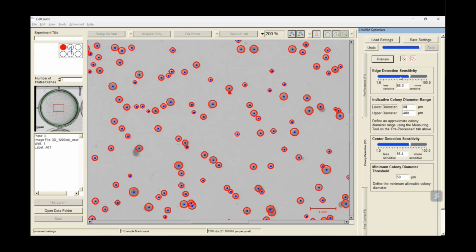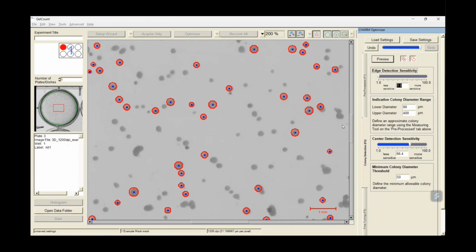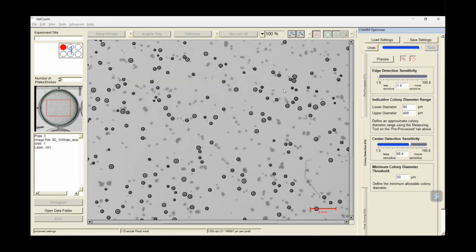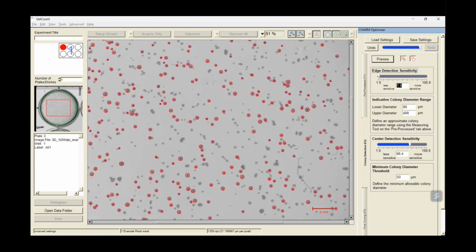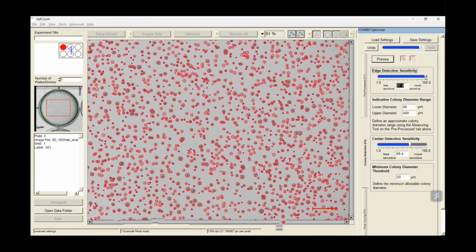And this is purely looking at trying to detect organoids based purely on the roundness of their edges. And really the thing to note here is if we back off the sensitivity, we'll actually lose a lot of objects. So, perfect. And sorry, we're just going to zoom out a little bit more here to make this easier to see. Again, if we go down, we'll see that we lose a lot of what are real colonies or organoids. And if by chance we slide it too far forward, you'll see we pick up a lot of things that likely are not organoids.